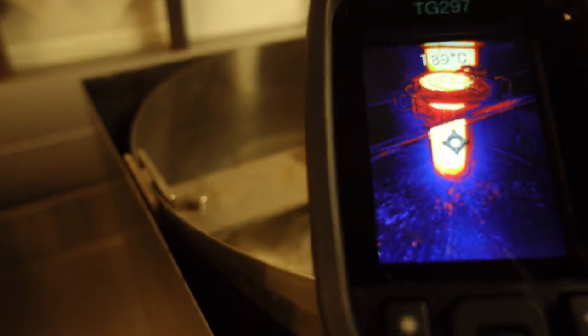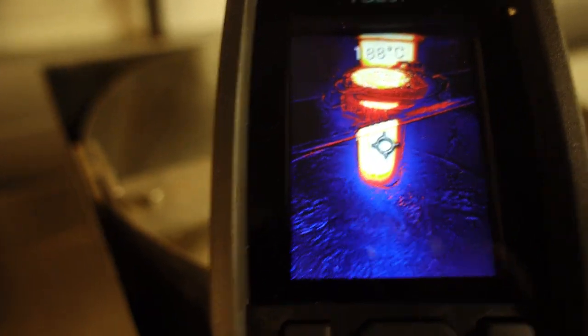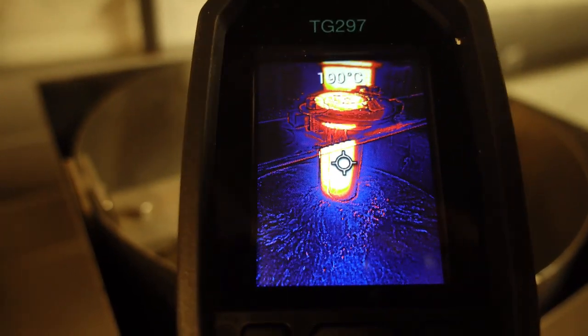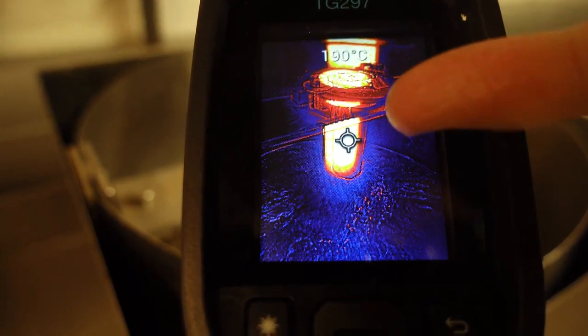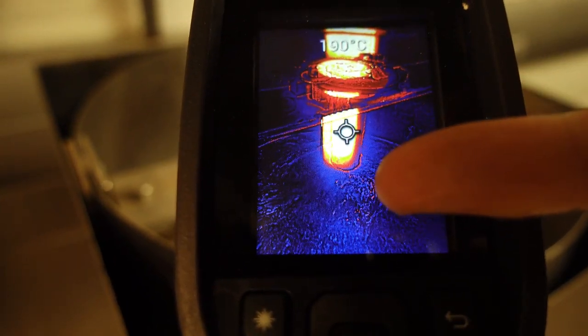Let's take a look at the thermal camera. The thermal camera doesn't really show a whole heck of a lot. It shows our sample still being extremely hot. And down below, you don't really see anything because it's not hot anymore. The bottom of the sample is essentially already down to the temperature of the water.